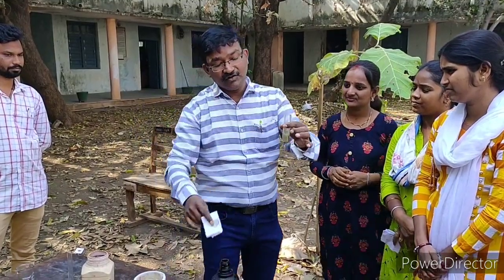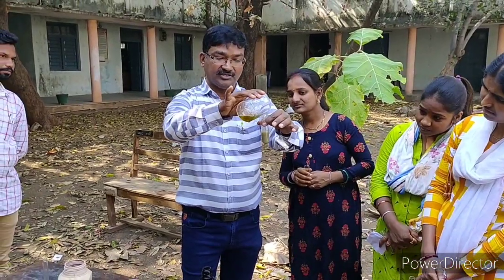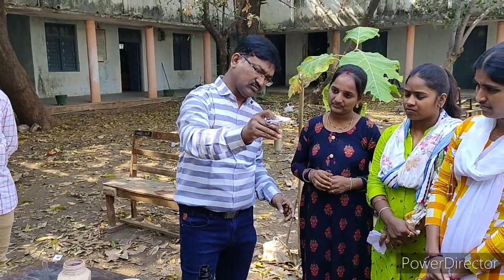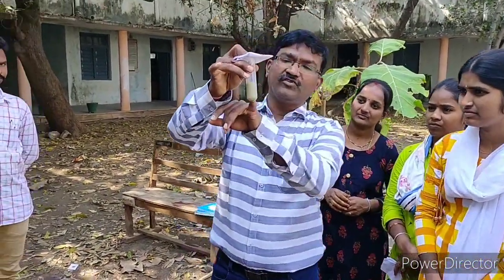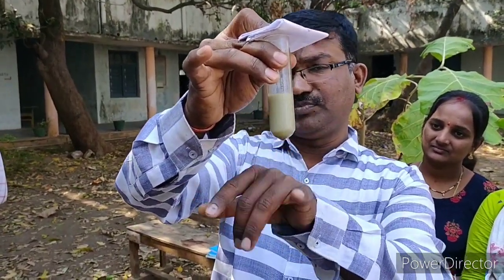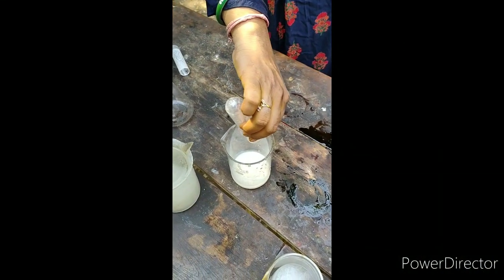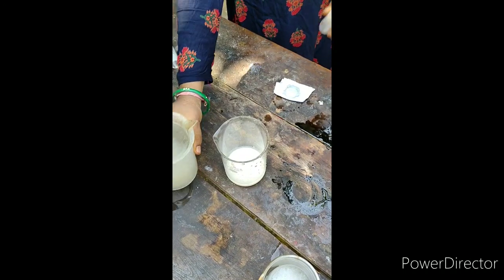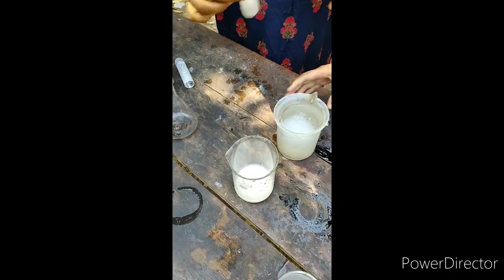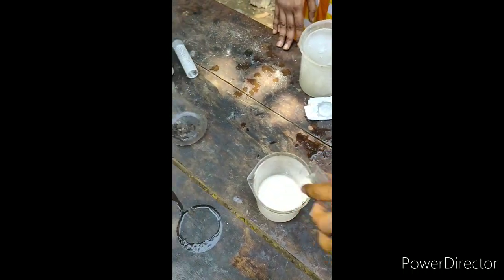After adding dimethyl sulfate many times, we will get a grayish-white color precipitate in the test tube. That is nothing but Nerolin, or beta-naphthyl methyl ether.